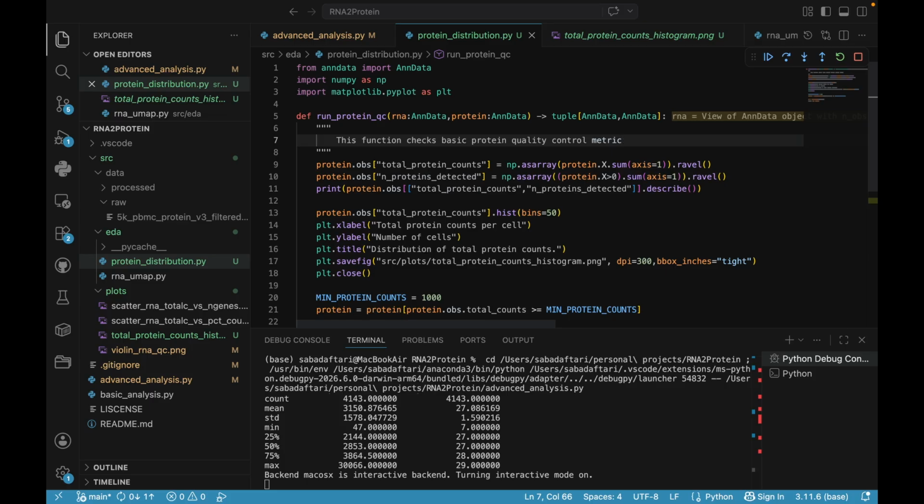And now I want to look at the distribution of each protein target. This is important for ML because if some proteins are highly expressed in many cells, expressed only in one immune cell type, mostly zero, noisy, it's going to be impossible to predict from RNA alone.